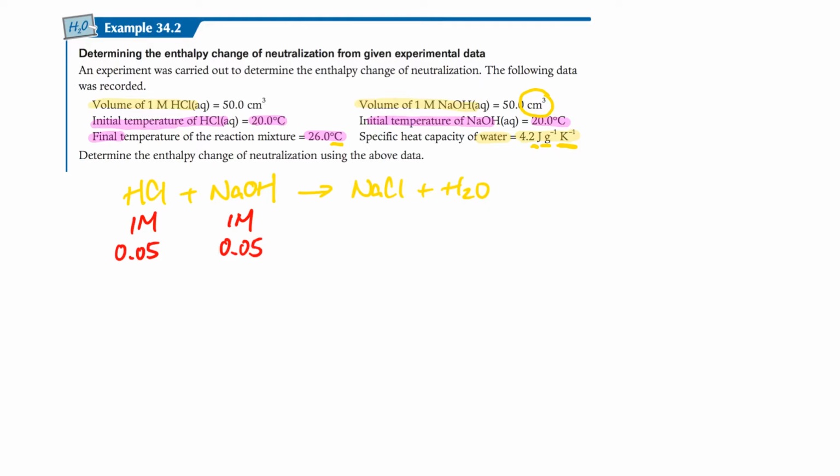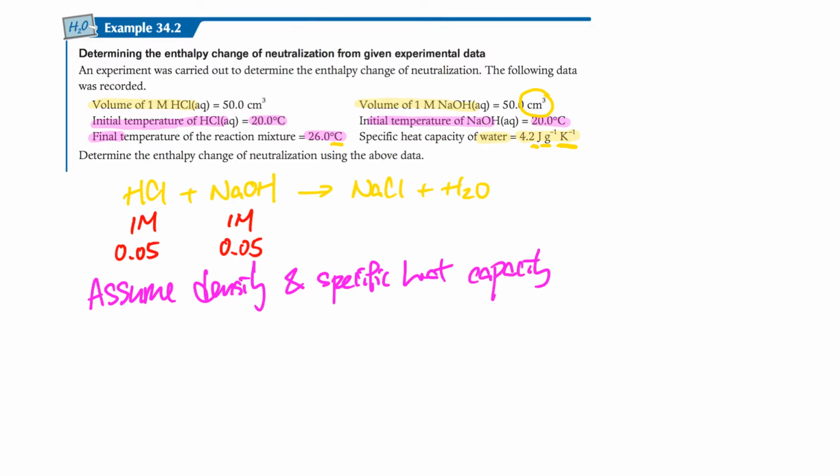So the first thing, we need an assumption: we assume the density and the specific heat capacity of the reaction mixture is the same as that of water.